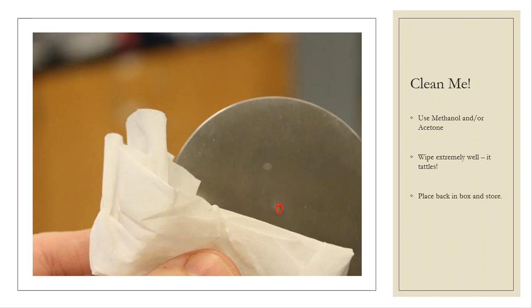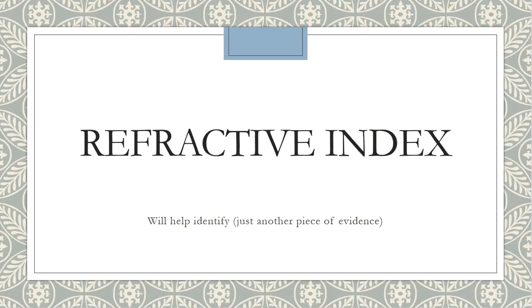All right. Now I'm not really finished yet. The directions don't tell me to do this in the lab, but I am going to do this in the grade sheet, and I need to confirm it. I need to confirm that that alkane is hexadecane, and I'm going to do that using refractive index.